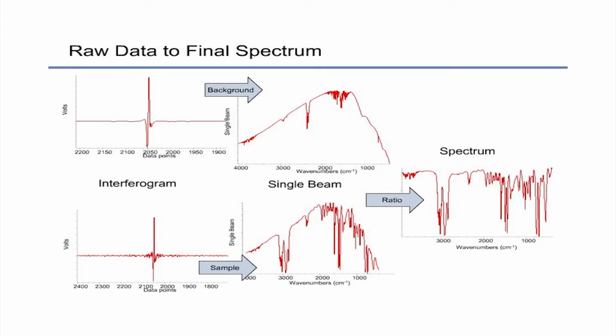The next time, you keep your sample and compare the output with the previous measurement. So this is my background. The background involves the response of my source, the response of my detector, and the response of the optics, whatever is present in the beam path.